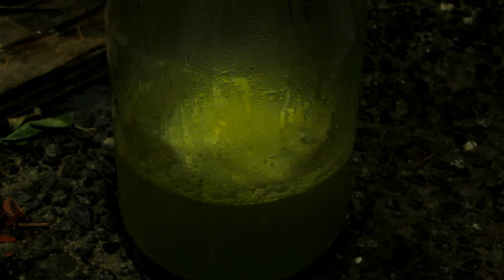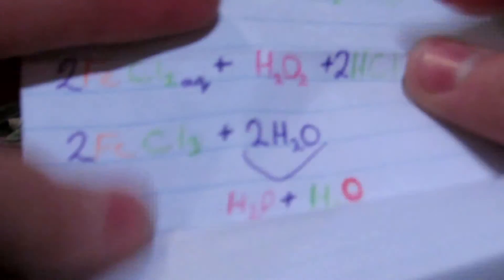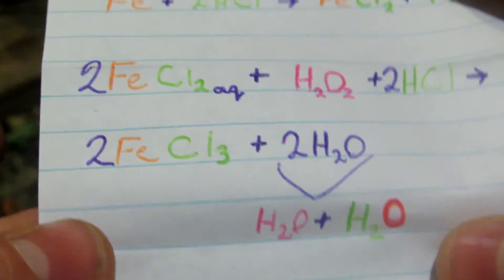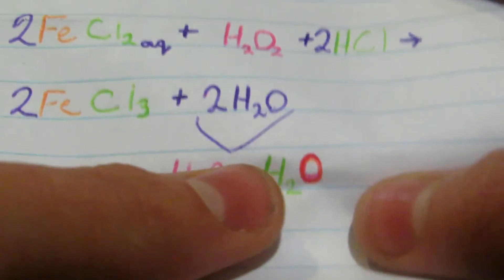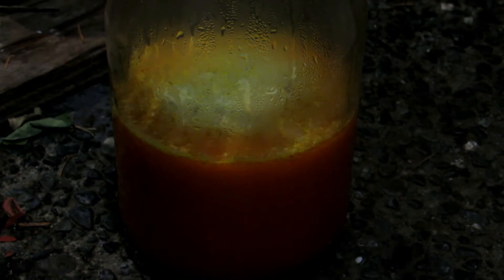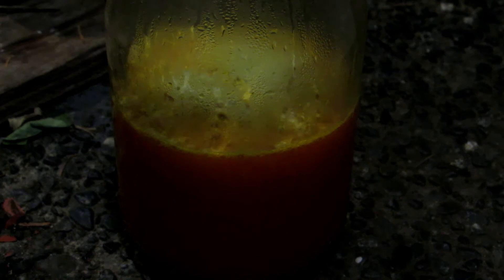After reacting, you can see it's very yellow — this is Iron 2 Chloride in solution; it's slightly greenish yellow. We do not want Iron 2 Chloride, we want Iron 3 Chloride. The second reaction: Iron 2 Chloride + H2O2 + excess HCl → 2 Iron 3 Chloride + 2 H2O. We'll take some 3% hydrogen peroxide and add it to the solution. You can use 3% rather than 35% because it's much cheaper. We should see a color change, and just like that we are converting Iron 2 Chloride to Iron 3 Chloride. We'll add a bit more and let it sit to fully react.